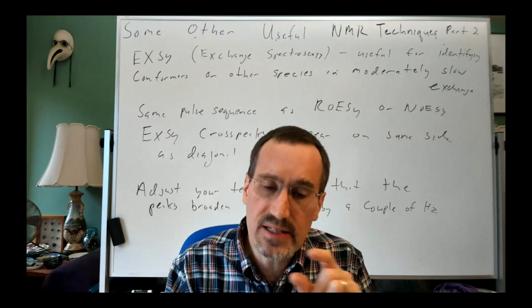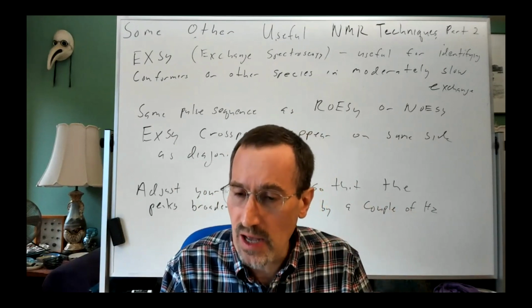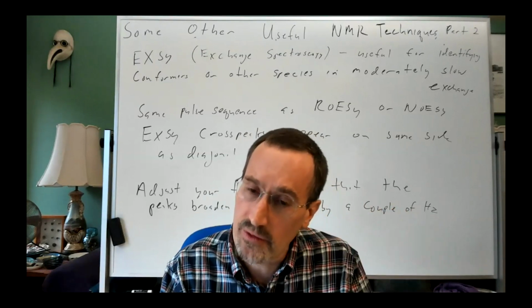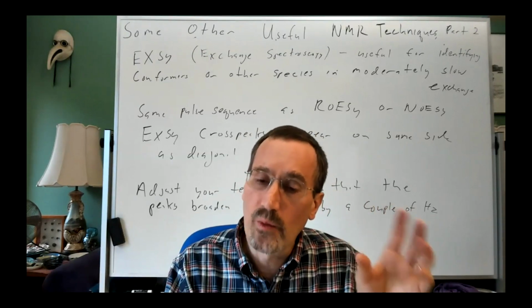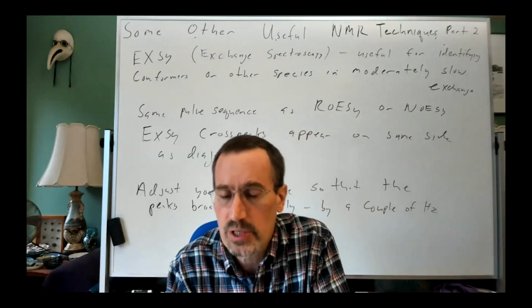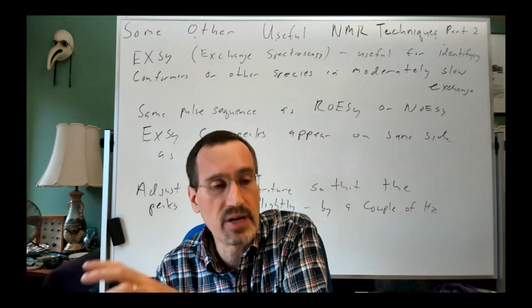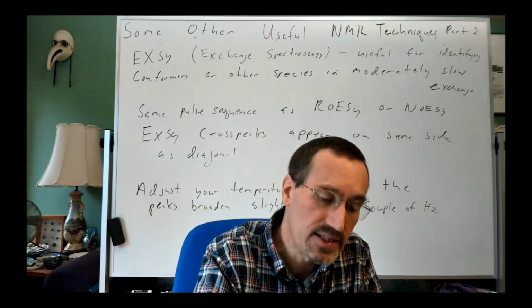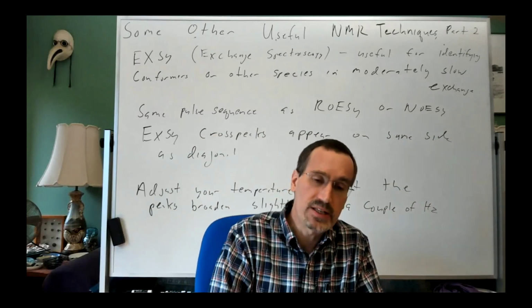And we think that some extra peaks in the proton NMR may be associated with rotamers about the Boc group. One way to establish that those extra peaks are from the rotamers is to show that they're in chemical exchange with the other rotamer. And so that's what he's going to be using this for.